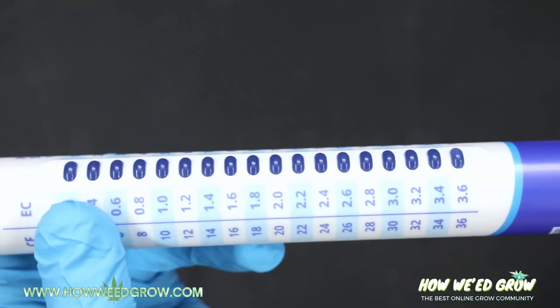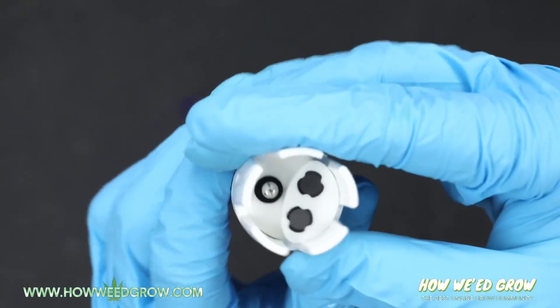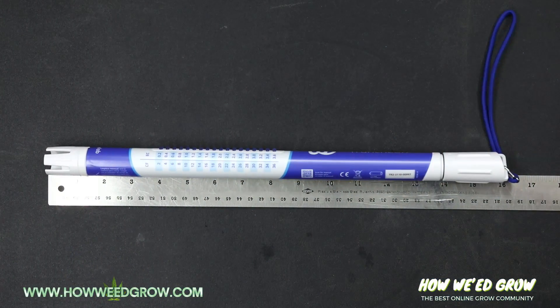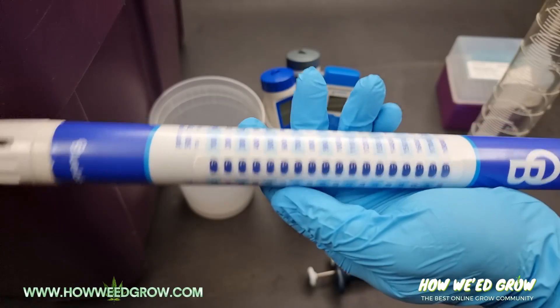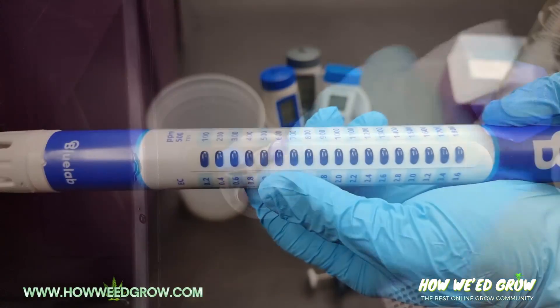On the positive side, the most beneficial feature is that this doubles as a mixer, but that's not enough to make up for the lack of accuracy. I would only recommend this if you're strictly using high ECs and aren't as specific with nutrient breakdowns like I am.